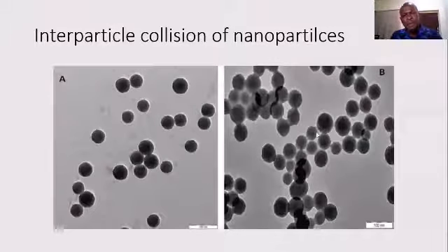But in Figure B, when the particles were treated with ultrasound, when the particles were collided with ultrasound, we found that the particles fuse together, they melt together. This is in accordance with what the work established, that when you have interparticle collision with ultrasound, the particles tend to collide, melt, and fuse together.